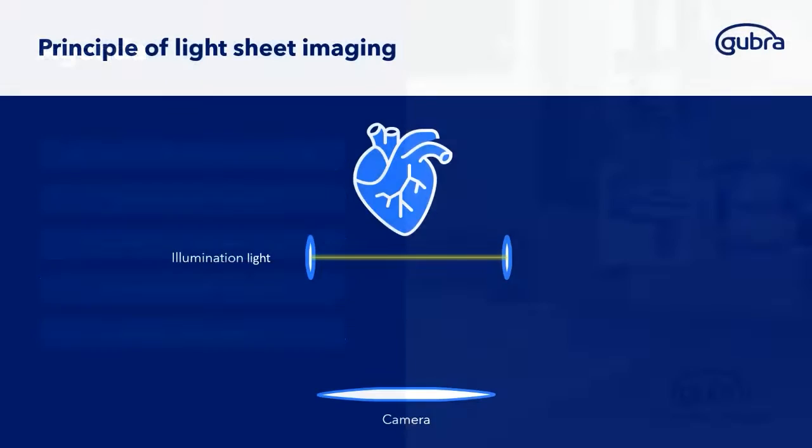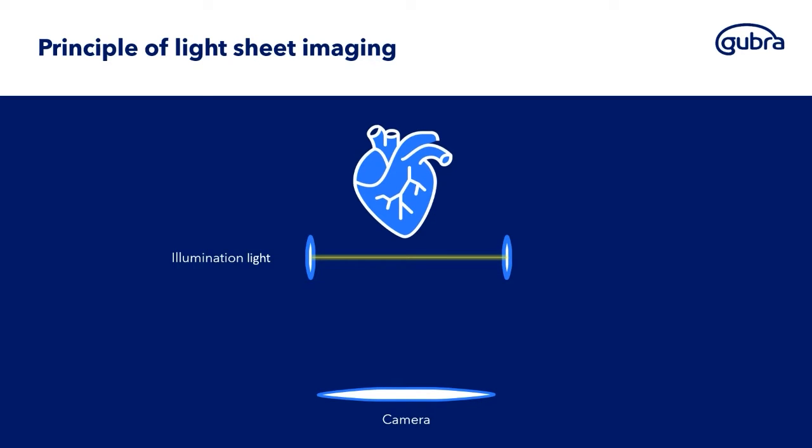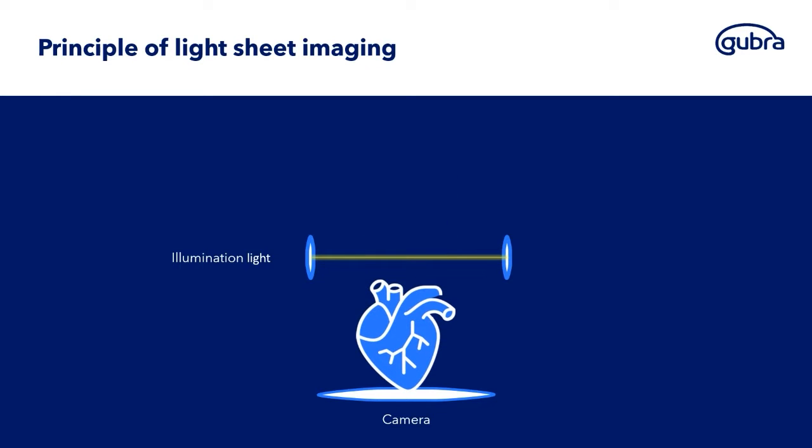So light sheet microscopy, in very simple terms, relies on moving the sample, like a heart here in this schematic, through a laser beam. And a camera that is located either below or above the sample is then capturing images at every 2 or 20 micrometer or whatever interval. And this really depends on the research question.